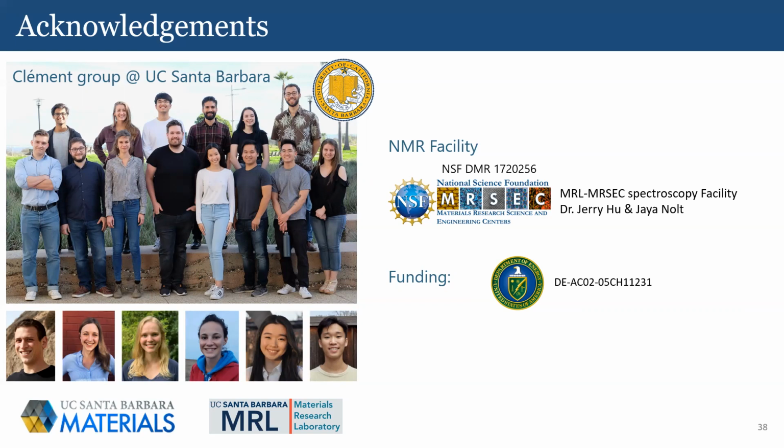So it doesn't rely on any kind of ordering, and you would see the difference between ordered and disordered phases. Or even if you have a crystalline structure, if you want some information on local environments that are not visible in XRD, NMR is a pretty good idea. The thing you have to remember is that NMR is a local probe, really, not a long-range one. I hope that answers your question.